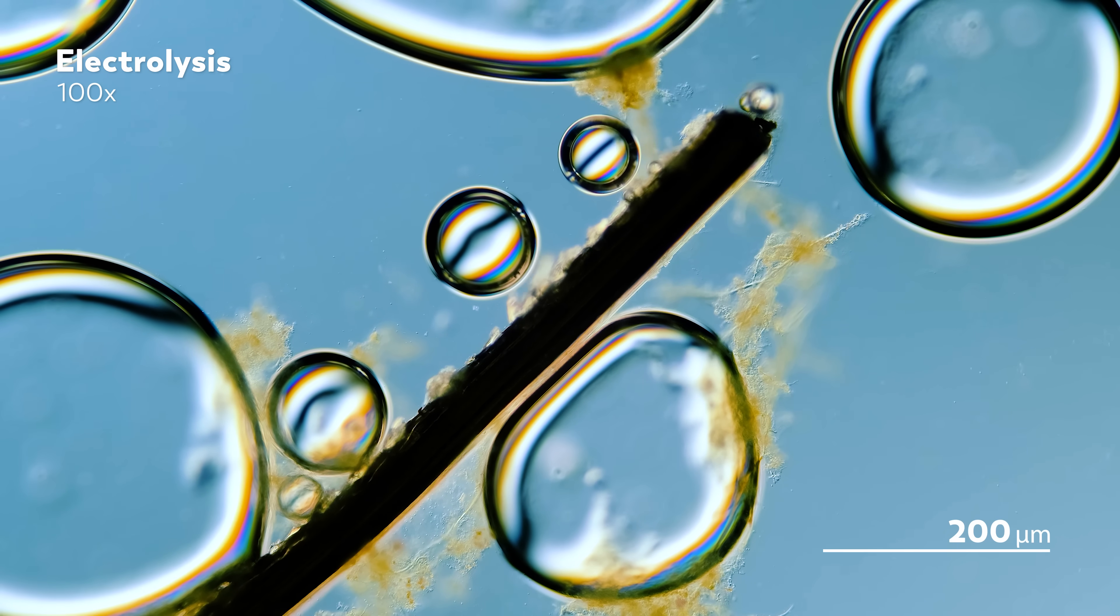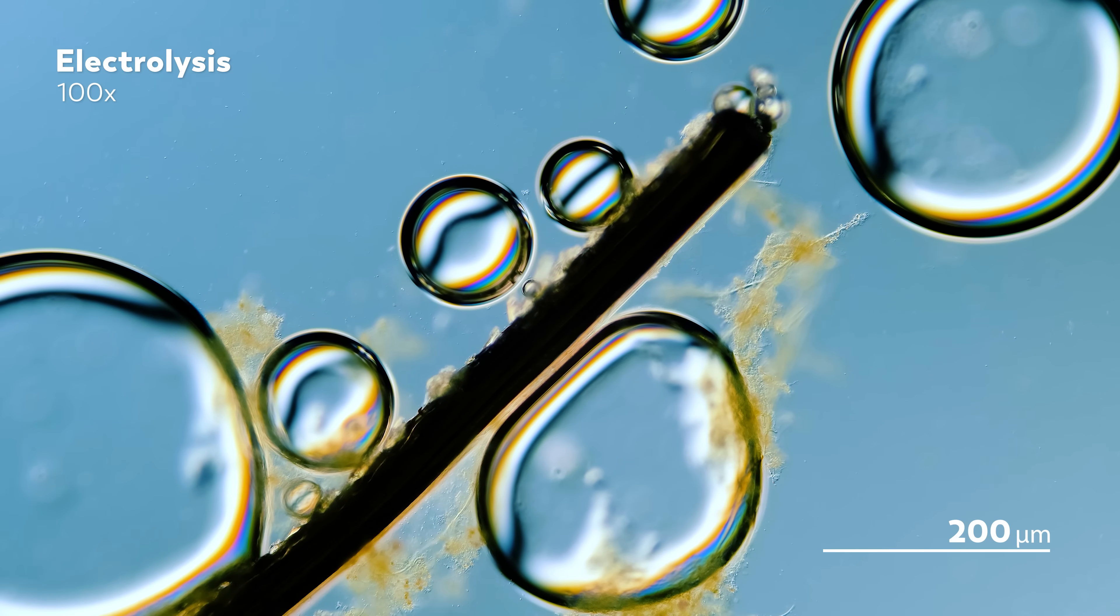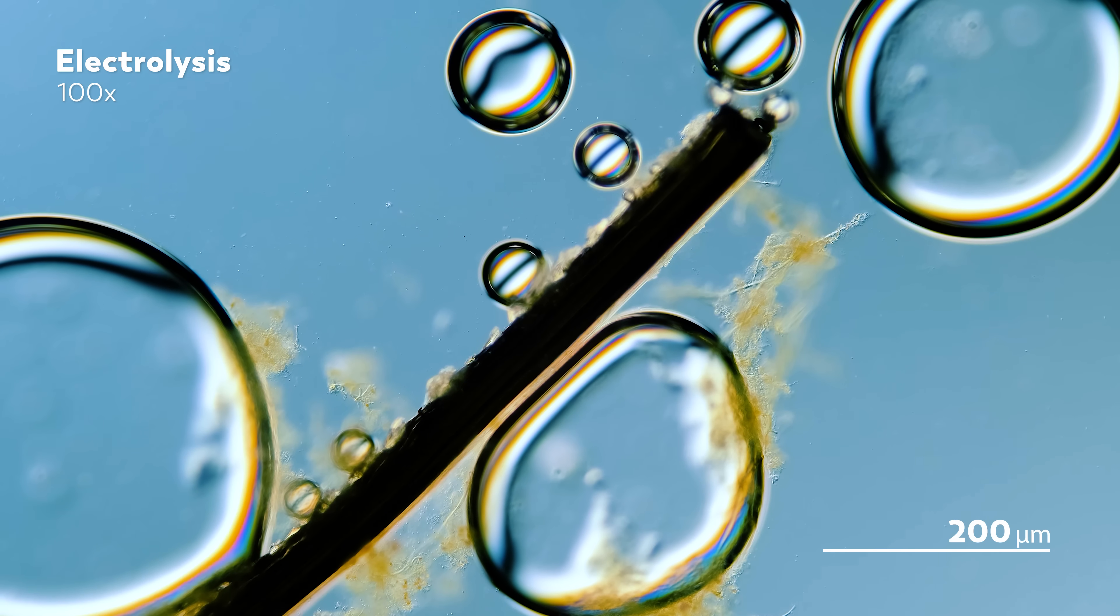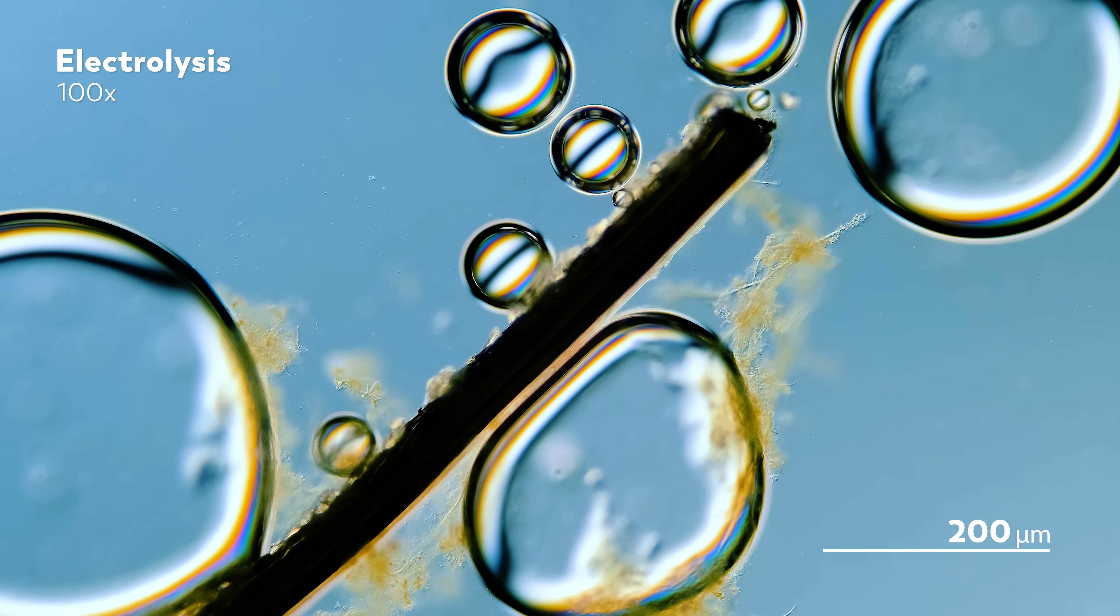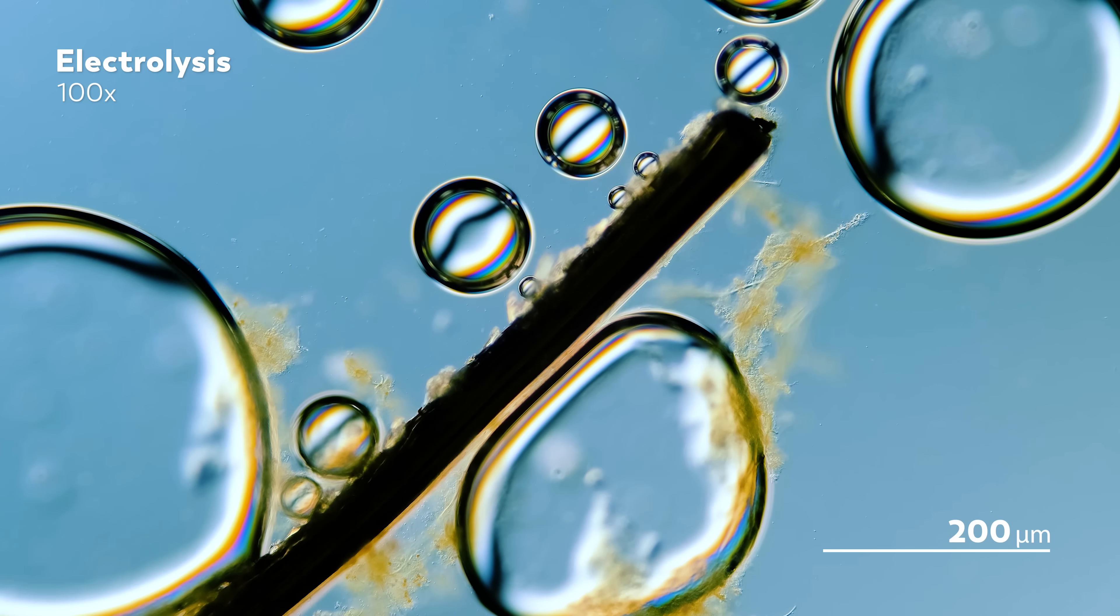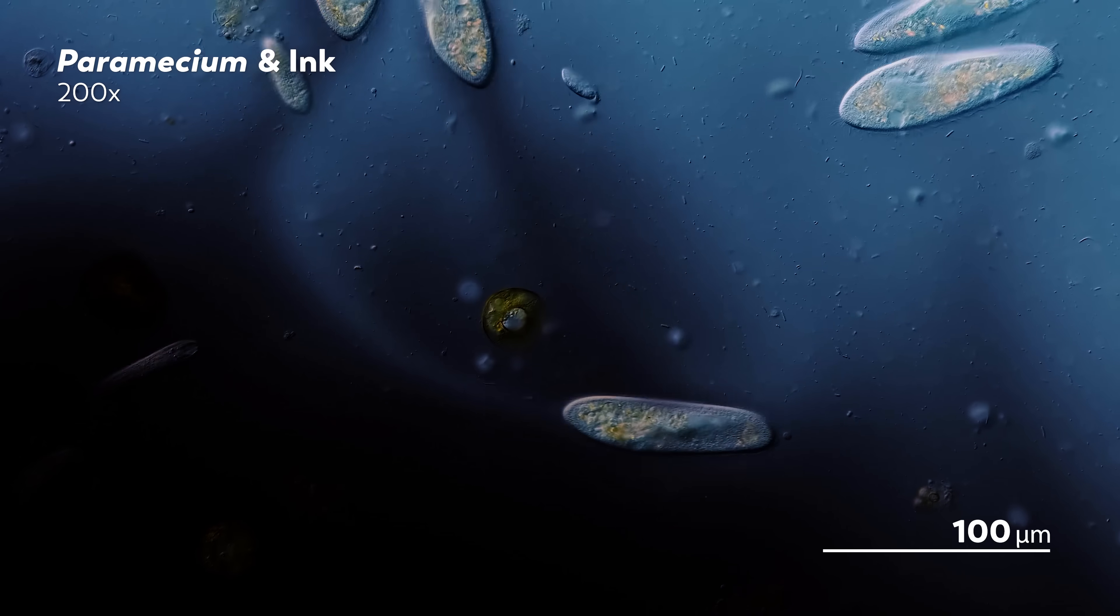And for James, the bubbles were a really fun sight to capture under the microscope. But they also inspired ideas for different experiments that he wants to carry out, like seeing how the hydrogen gas might affect some of his samples. And that's the very same spirit that has been guiding microscopists for centuries.